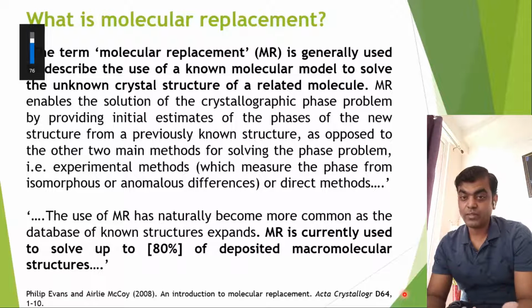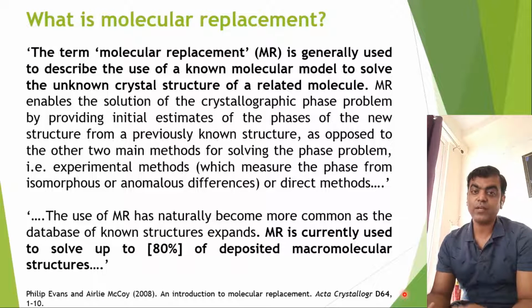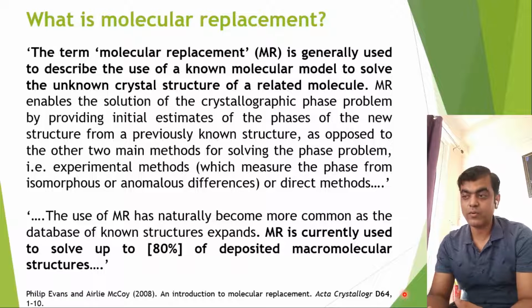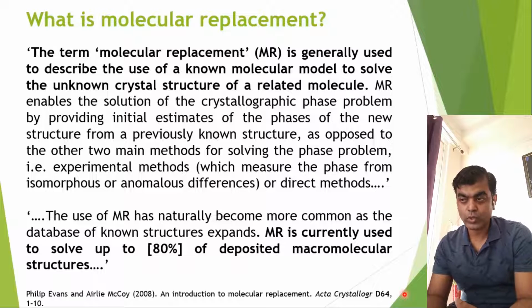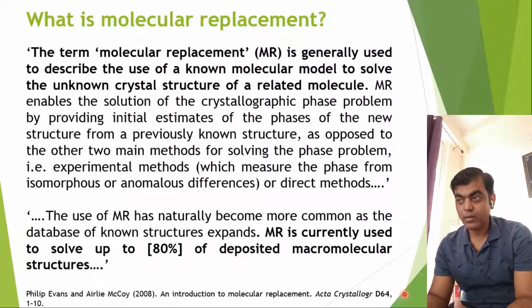So what you have to do is just go to that library, take your model, try to fit it, get a closely fitting known structure, get the phase information out of it, right? So MR is currently used to solve almost 80% of deposited macromolecular structures. That is huge, right? That is molecular replacement.